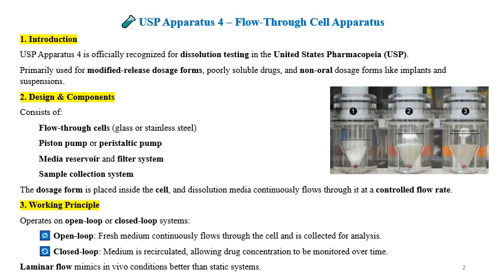The formulation or dosage form is placed inside the cell and the dissolution media continuously flows through it at a specified or controlled flow rate. That's why it is named the flow-through cell apparatus.